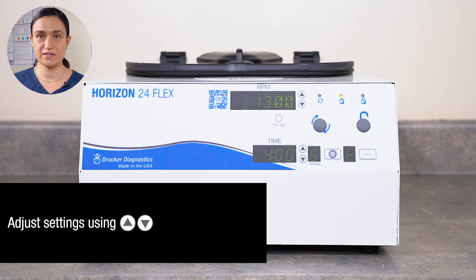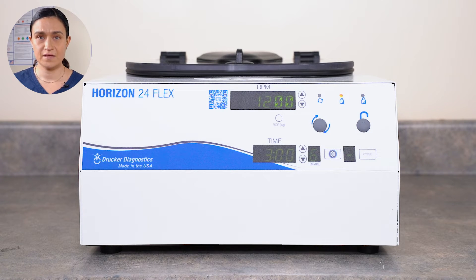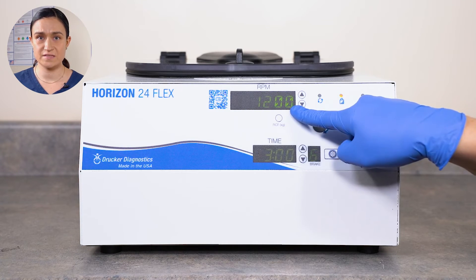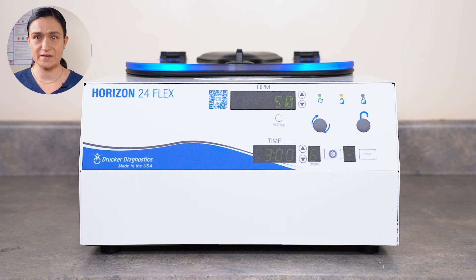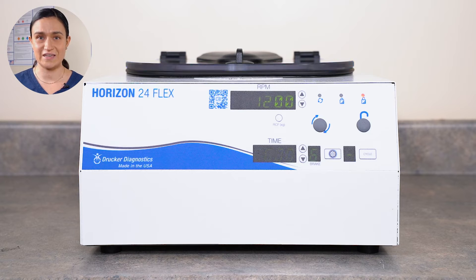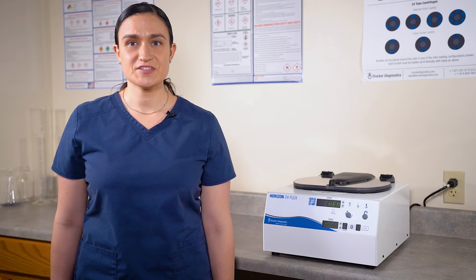Next, adjust your settings. You can adjust RPM and time using the arrow buttons next to the display windows. In our case, we're going to run 1200 RPM for three minutes, but you can run whatever setting you like. Once you're done programming, double check your settings, then press the Start button. The centrifuge will automatically lock and the rotor will begin to spin, accelerating until it reaches your selected RPM. It will then run for your chosen time — you can see time remaining on the time screen. Once the run is complete, the centrifuge will begin to slow down, applying the rotor brake at the level you selected. When the rotor is fully stopped, the centrifuge will beep and the lid lights will flash to let you know it's done. The centrifuge will automatically unlock. Turn the lid latch a quarter turn counterclockwise and then lift the lid to retrieve your spun samples. And that's all there is to it — you just ran your first cycle.